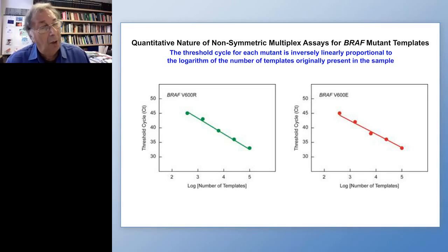So we are very excited by these results. We think that multiplex assays can be developed to look at multiple mutations, perhaps even all seven or eight different KRAS mutations that occur in two codons, each lit up by different colored molecular beacons. And this will allow simple blood samples to be taken, and the DNA in the plasma can be analyzed, and a physician can get a picture of which mutations are present or absent, and if they're present, what their relative numbers are.